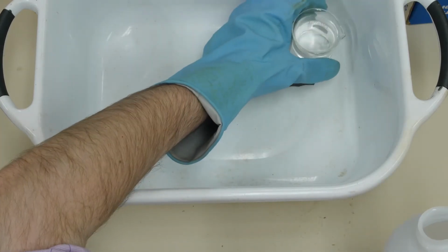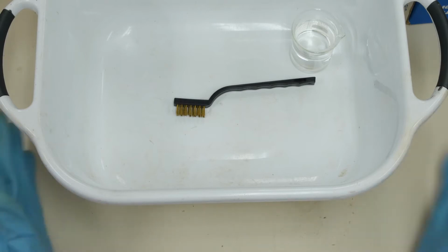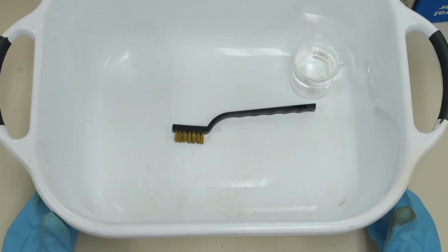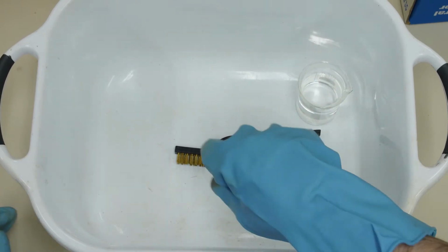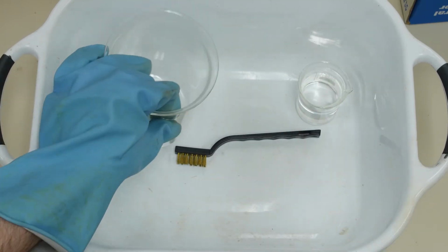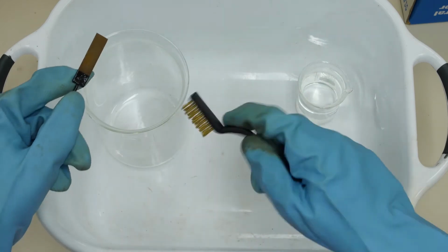Cleaning the coupons takes some time, and it's important to be careful so as not to scratch off the black plastic coating on the coupons. Parts of the video have been sped up so as not to be tedious.